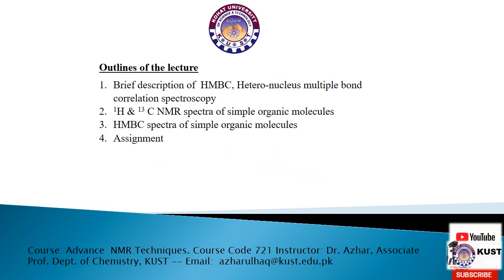Outlines of the lecture or the course. Some salient features of HMBC would be discussed briefly in this lecture. Detailed description of the technique would be given in the later lectures of this online series. Then proton and carbon-13 NMR spectrum of some simple organic compound would be discussed, because it is necessary to know about these before going into the detail of HMBC.